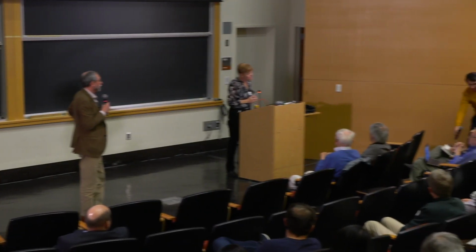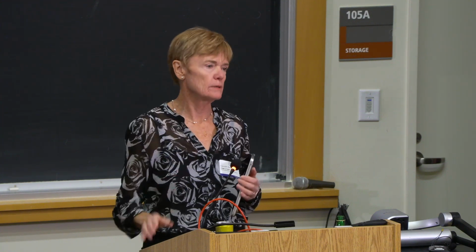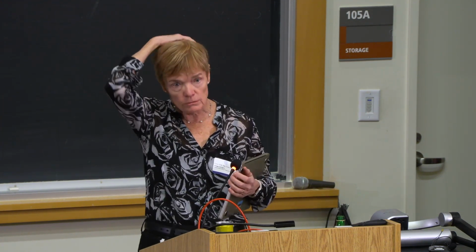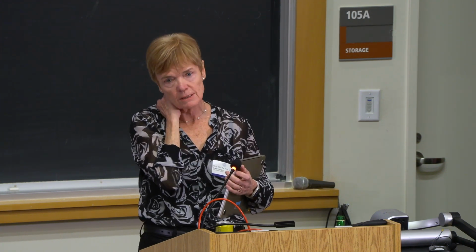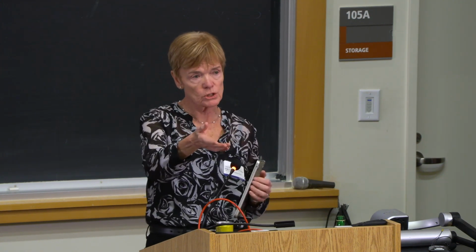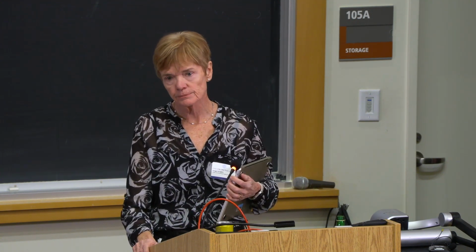Try to generate some synthetic data. There's an entire synthetic data set that's identically matched to the phantom data, the same proteins in it, the same size things, the same ice thickness, on the portal that the machine learning community is using very heavily to train. But as you all know, synthetic data always works. You can always find the particles in synthetic data. You can't necessarily find them in real data. And Chris and Richard and our group had a very interesting discussion yesterday about the very urgent need for good synthetic data, synthetic data that models real biology. I think that's an area we should be pursuing quite hard to solve some of these problems, and then, as Richard says, model them well so that we know what we should be going after and what is possible. We can't really do that yet.